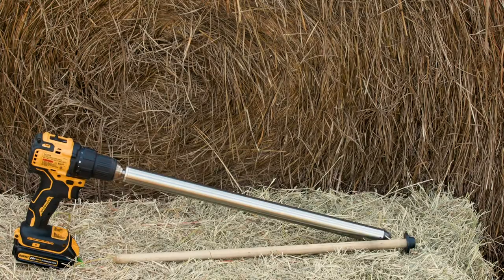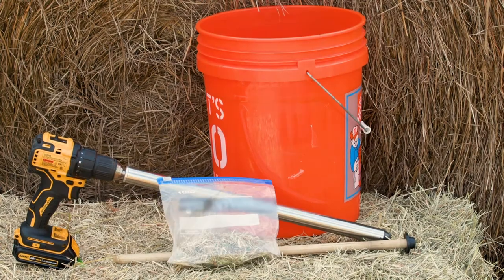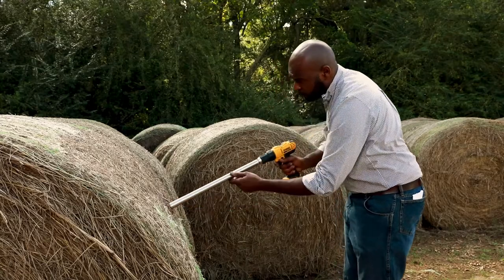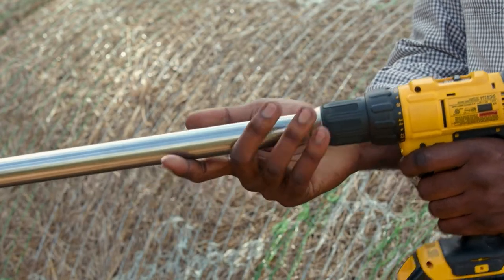Equipment required for collecting a hay sample includes a forage probe, a mixing bucket, and sample bags. Each county extension office has a forage probe that can be used to collect samples on a farm. The forage probe is operated using an electric drill.